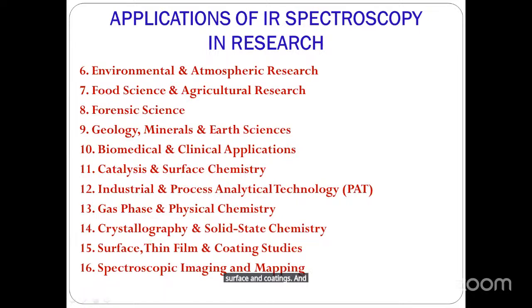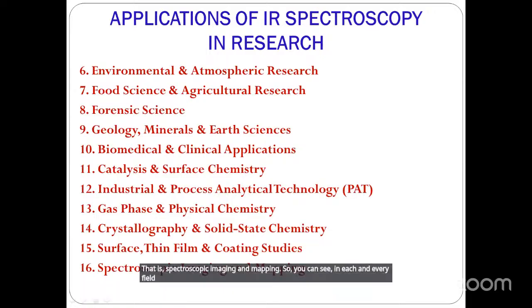And another important thing is spectroscopic imaging and mapping. So you can see in each and every field, there are applications of IR spectroscopy.